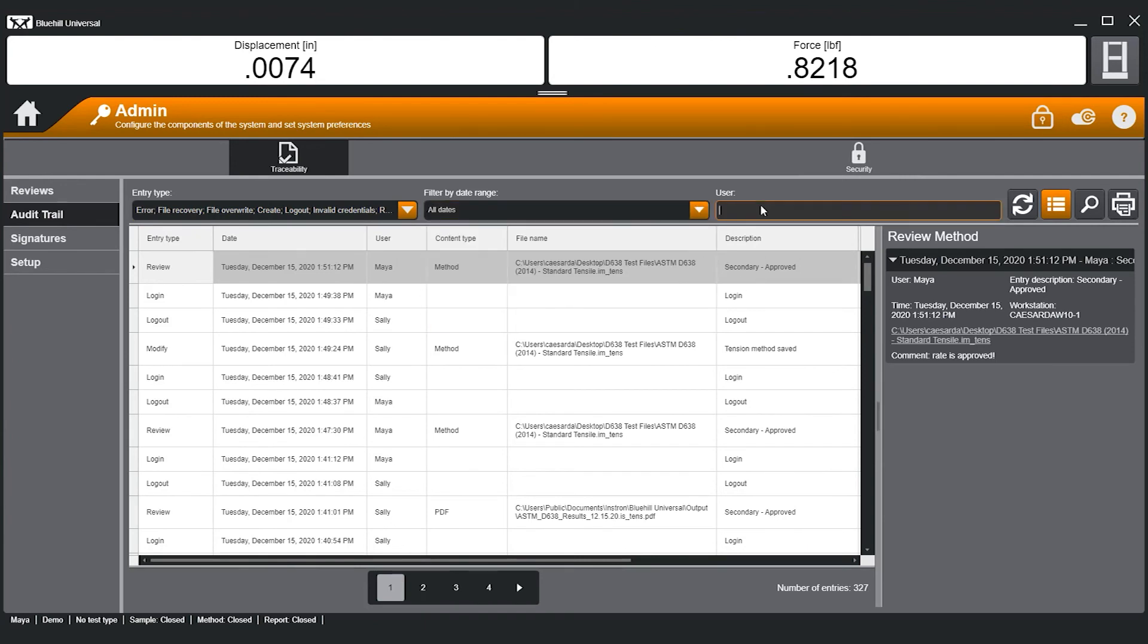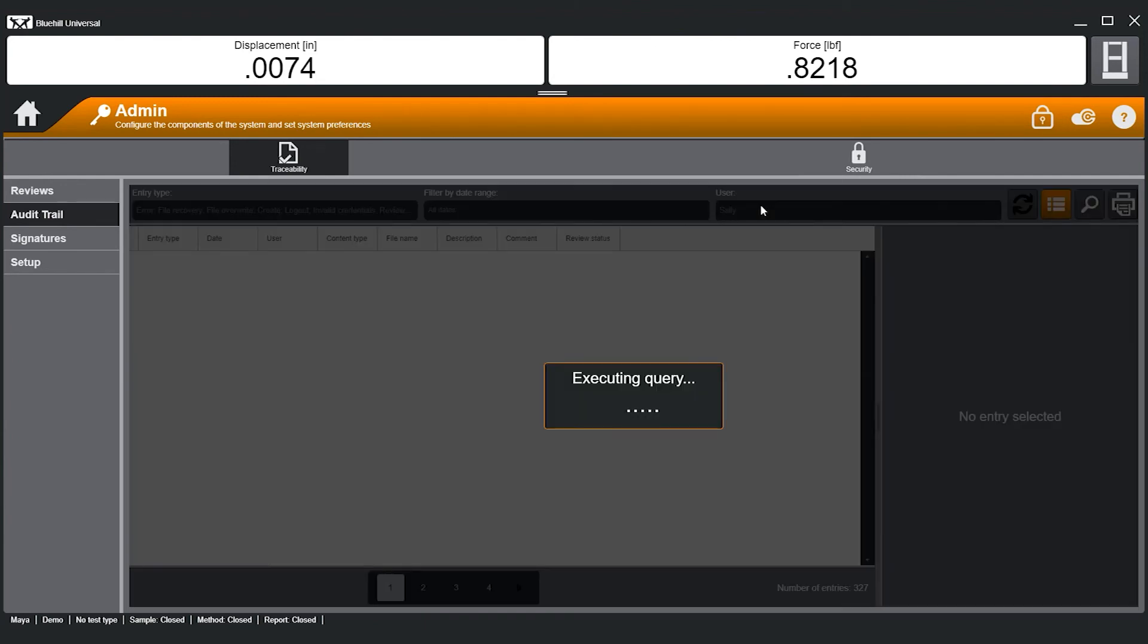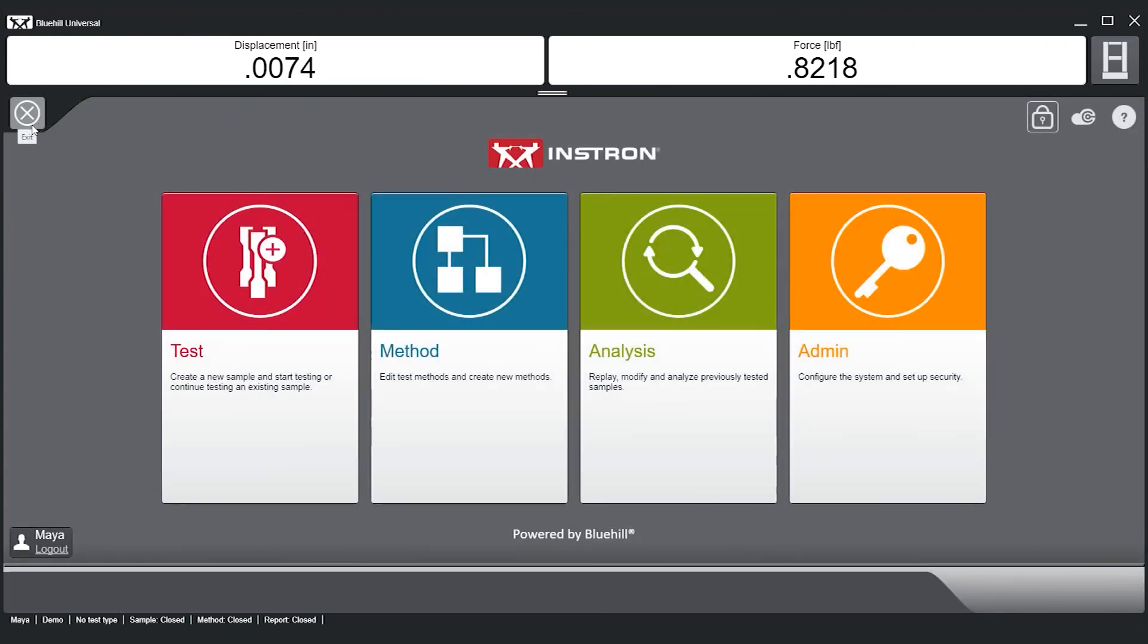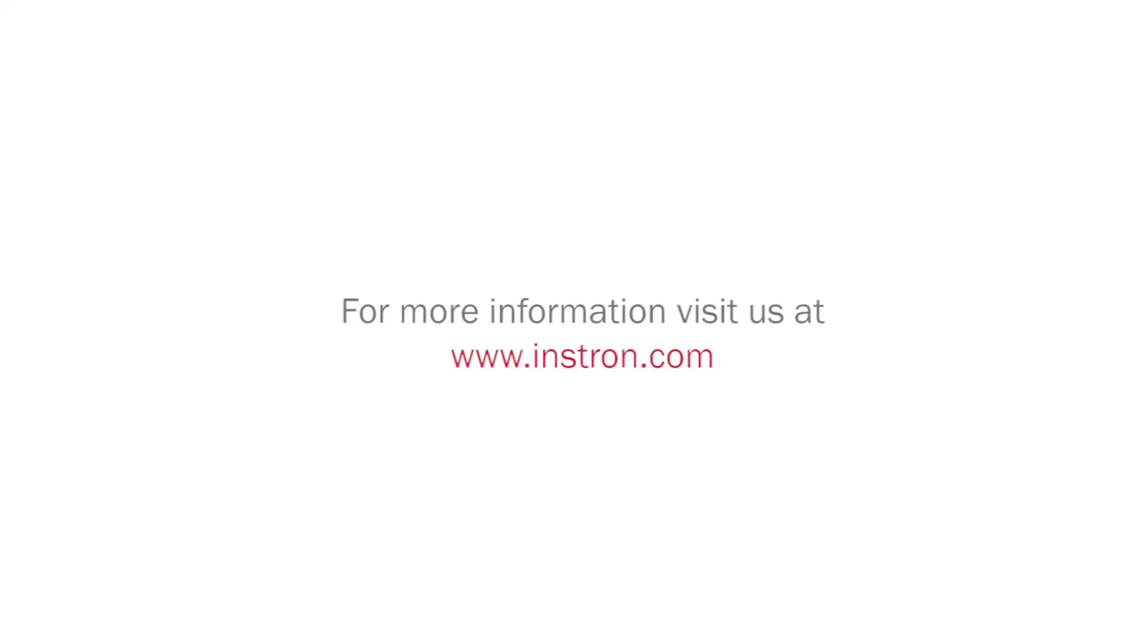In summary, Bluehill Universal's Traceability module utilizes security permissions, file revision history, and electronic signatures to allow users to know who, what, when, and why in a fully searchable and secure audit trail. To learn more, visit us at www.instron.com.